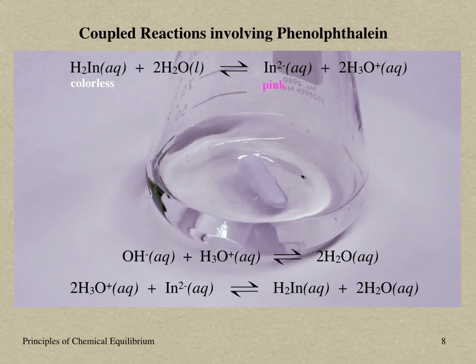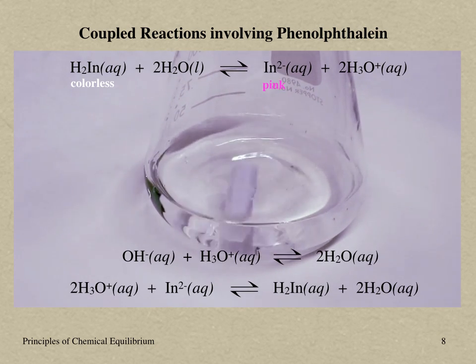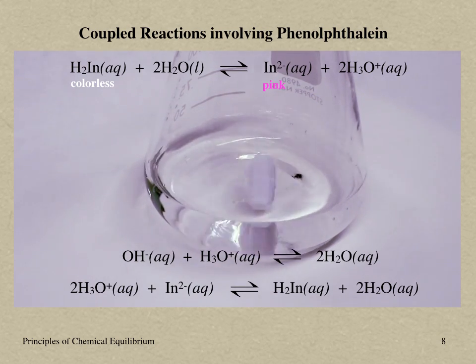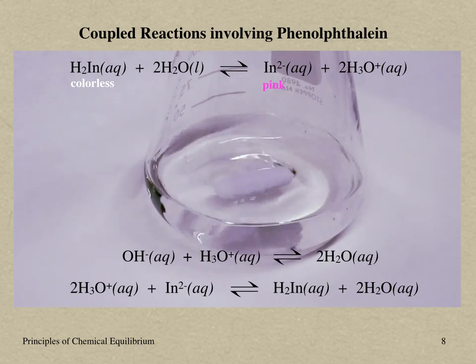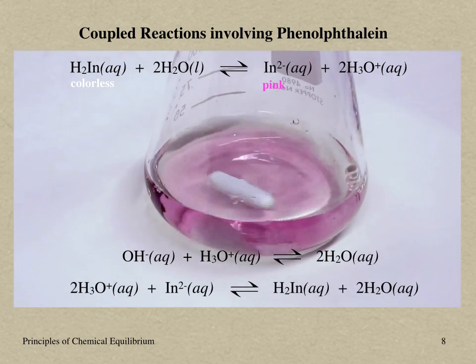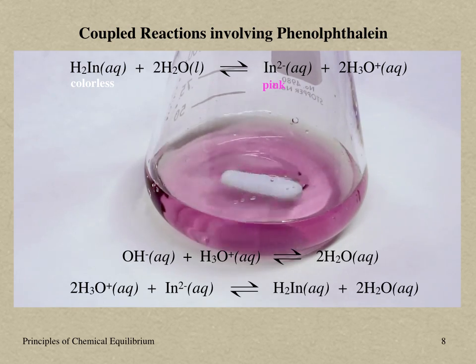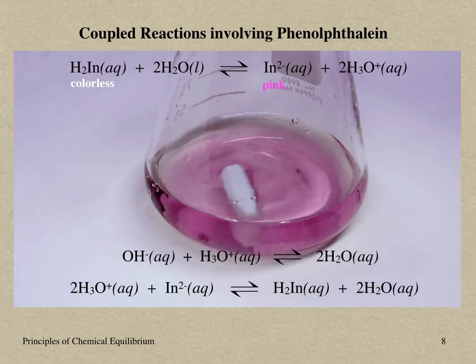Several drops of phenolphthalein solution have been added to about 20 ml of water in this flask. The solution is stirred magnetically to ensure adequate mixing of any added reagents. Let's initially add a small amount of the base sodium hydroxide. Note that the added base reacts with the proton liberated in the phenolphthalein equilibrium, temporarily lowering its concentration, which shifts this equilibrium to the right.